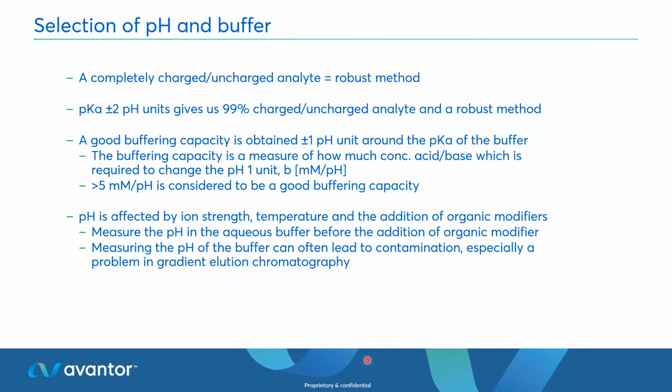Final couple of slides are just on some housekeeping. I've said most of this. Make sure you are using a buffer. Ideally work 2 pH units away from the pKa, and other things affect pH, like the temperature, like what solvent you're using with it. So do be aware of those factors.